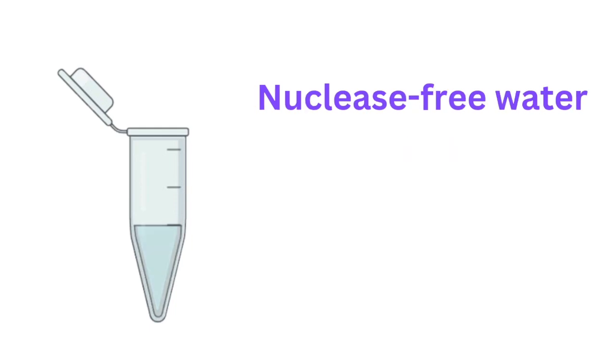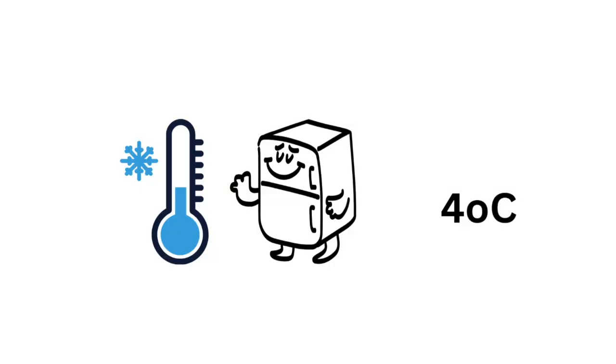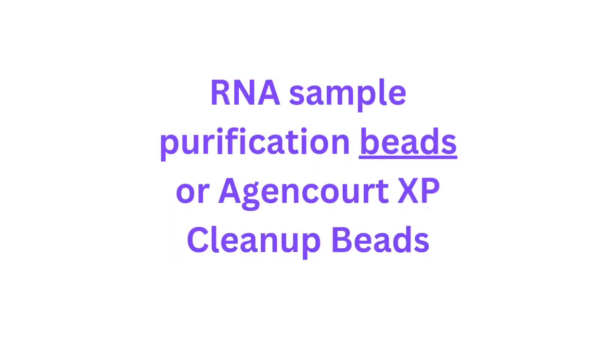These items have to be stored at -20. Then the following item has to be stored in the fridge. You don't want to freeze it. So you're going to be given the RNA sample purification beads.